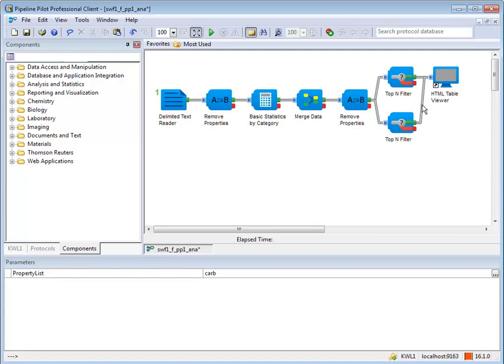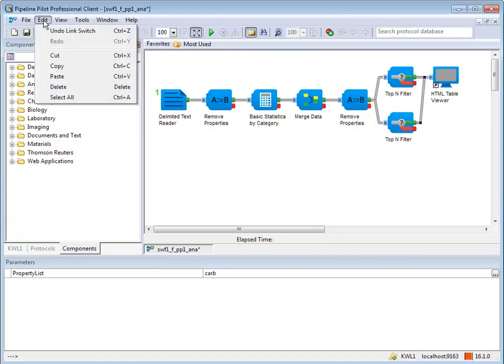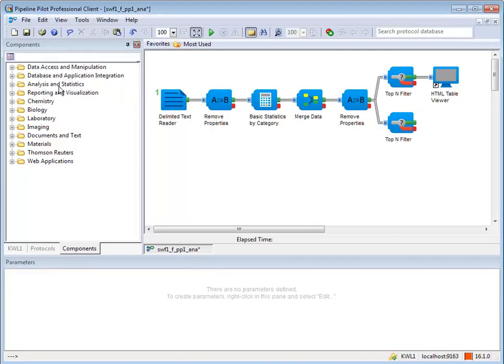If you want to remove a pipe, select it, then cut or delete it using your keyboard, the standard toolbar, or the Edit menu. Note the Edit menu also includes copy and paste commands. The pipe has been removed.